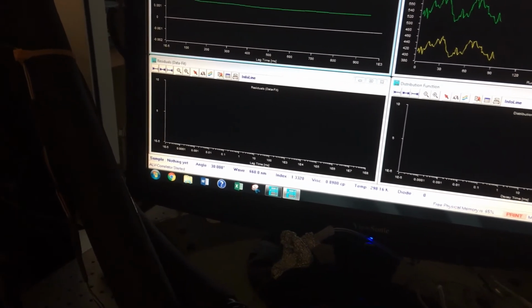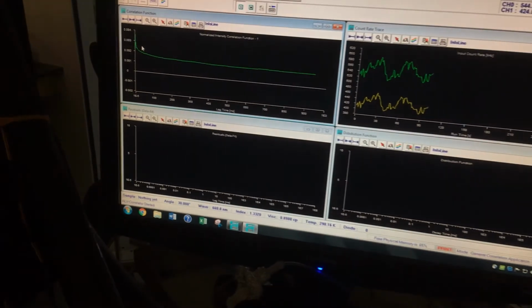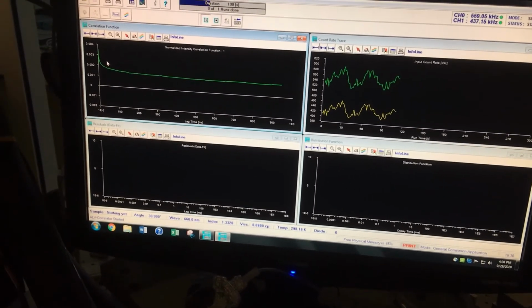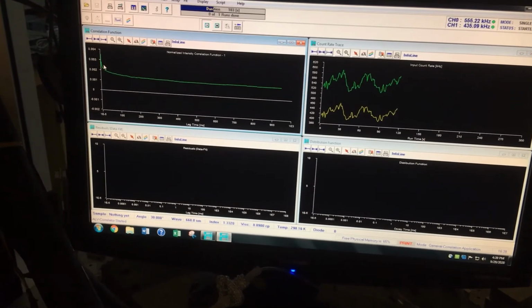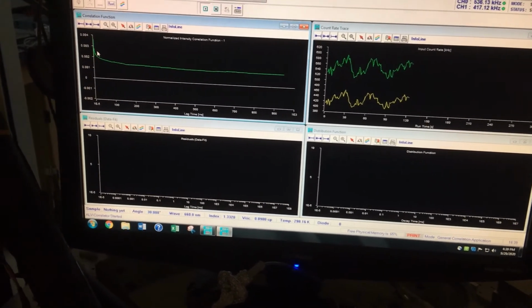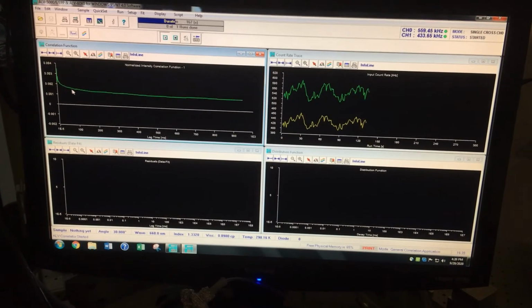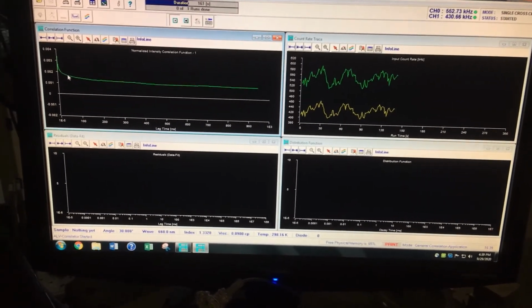And I think if you're experienced at looking at these things, you will say this just doesn't look like a monodispersed system. And that's what we're thinking about doing with this particular experiment, is using this as a sort of budget version to characterize cellulose nanocrystal size distributions. I think what we would probably want here is a longer cell, so the light has to go through a longer path. That will give us more signal over the leaked light from the cell. And we probably would go to actually a less expensive cell.